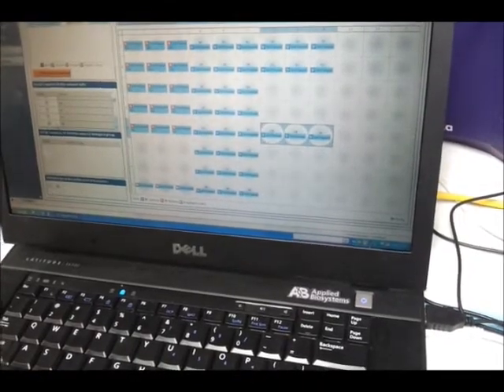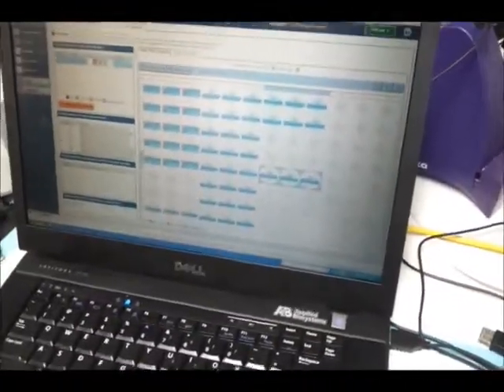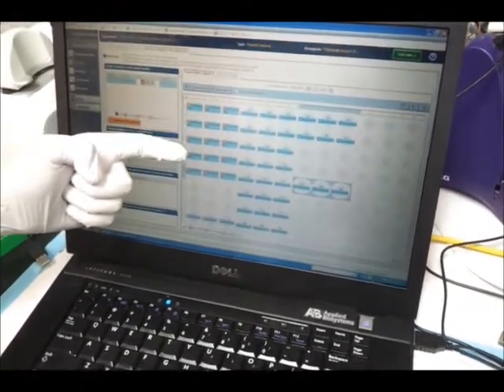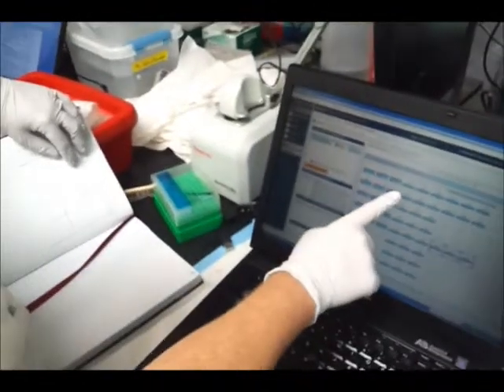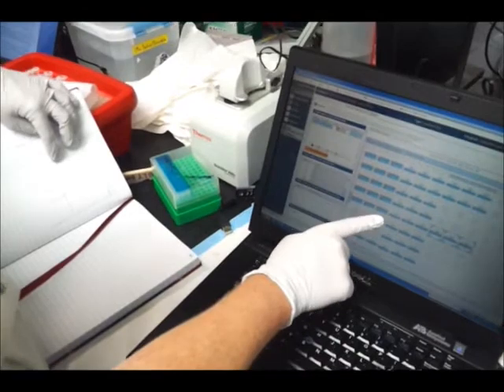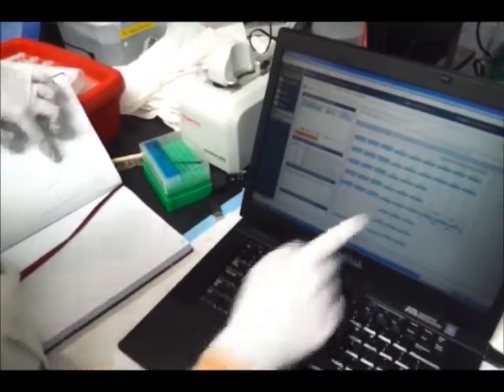Okay. So we've assigned the target, the assay, to all of the wells that we used. We assigned the standard, 1 to the 10 to the 5th, 4, 3, 2, and 1. We have the negative control here, and we have all the samples. I'm just going to quadruple check it against my own personal layout. So BU, SB, BO, LG, PT, LO, TL, HB, SP, RG, extraction blank.